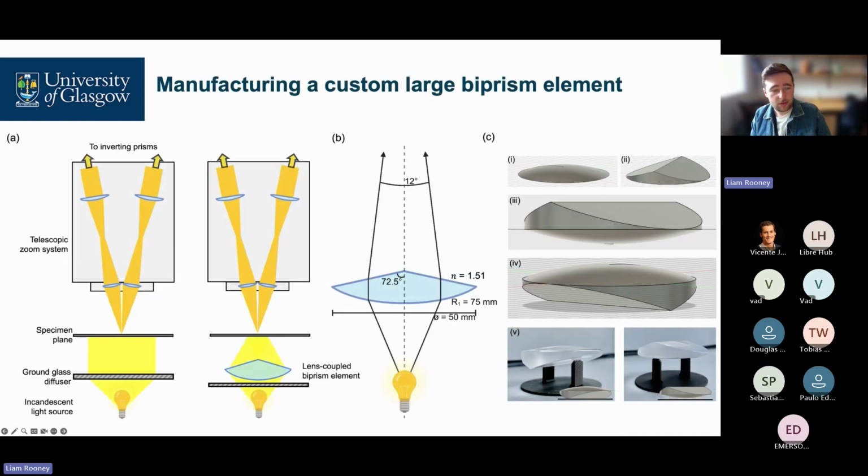And basically, if you're familiar with stereo microscopy, it's commonly used in material sciences and manufacturing. It's used a little bit in the life sciences, but it's really limited by the optical performance in transparent samples. And that's due to the way that, on the left here that I show, the illumination isn't optimally designed.